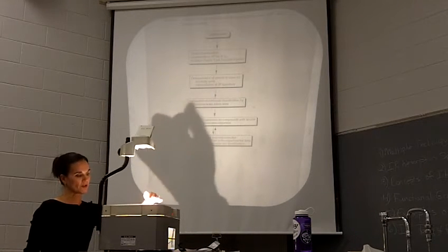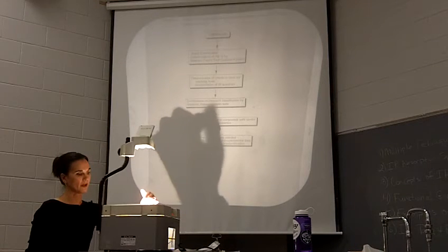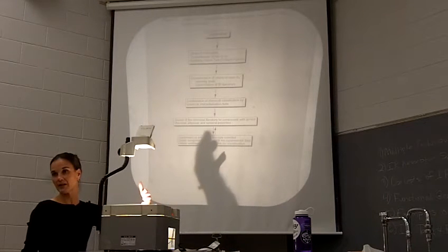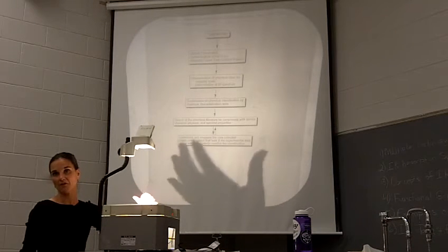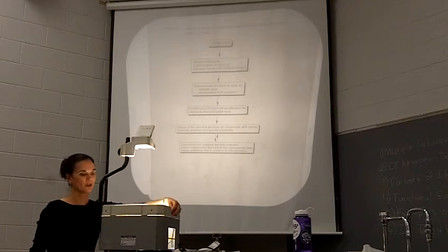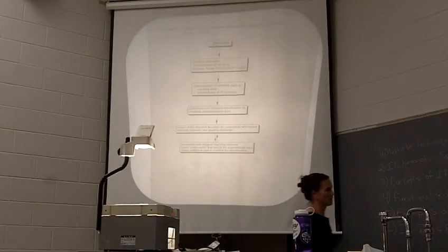And then you're going to search the literature for compounds with similar chemical, physical, and spectral properties, and then decide what your unknown is. What is the specific identity of your unknown, okay? So this is the flow chart that you're going to use for experiment 6.